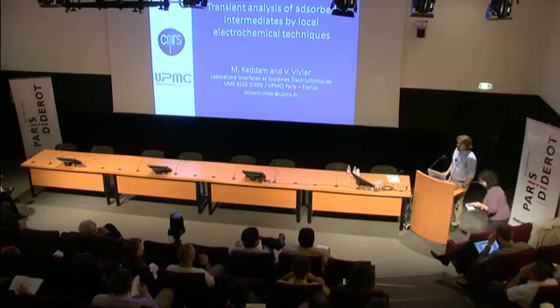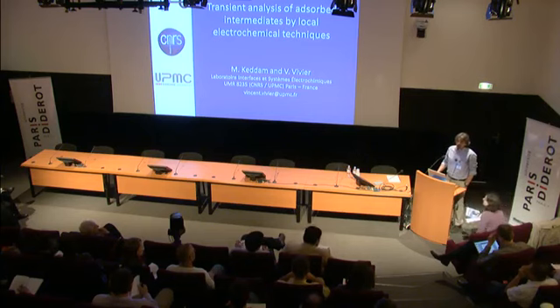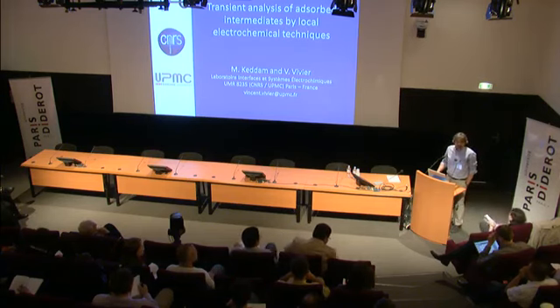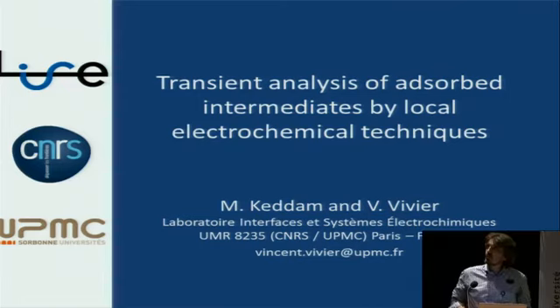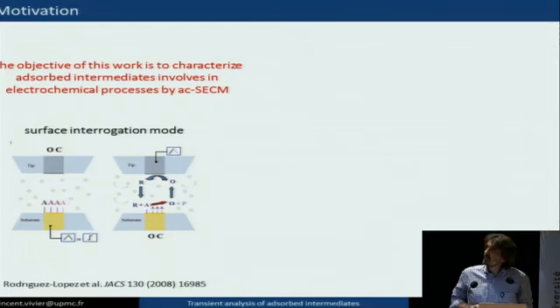Thank you. So first, I would like to thank the symposium organizer and the organizing committee for giving me the opportunity to present the work we are performing at LISE. In our lab, we use a lot of impedance spectroscopy, and I will try to show you that we can use this technique in order to characterize adsorbed intermediates at an electrode surface.